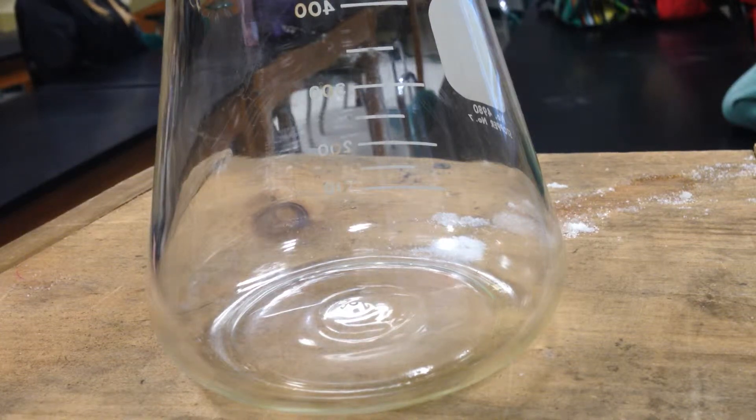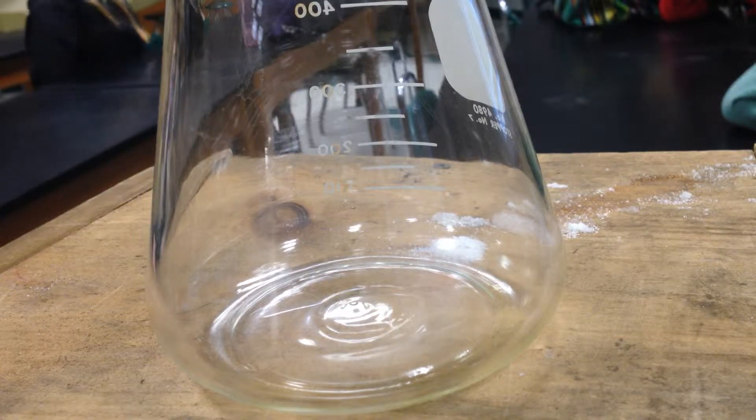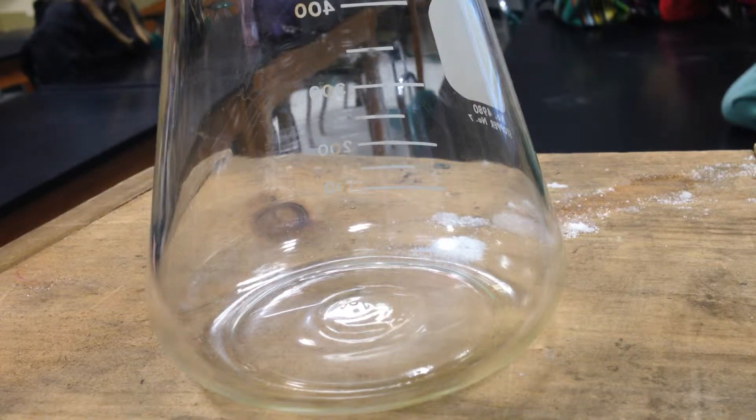All right, so this is a demonstration of changing the ligand on a copper ion. We have complex ions we're going to make today. Our ion that we're using is copper plus two.